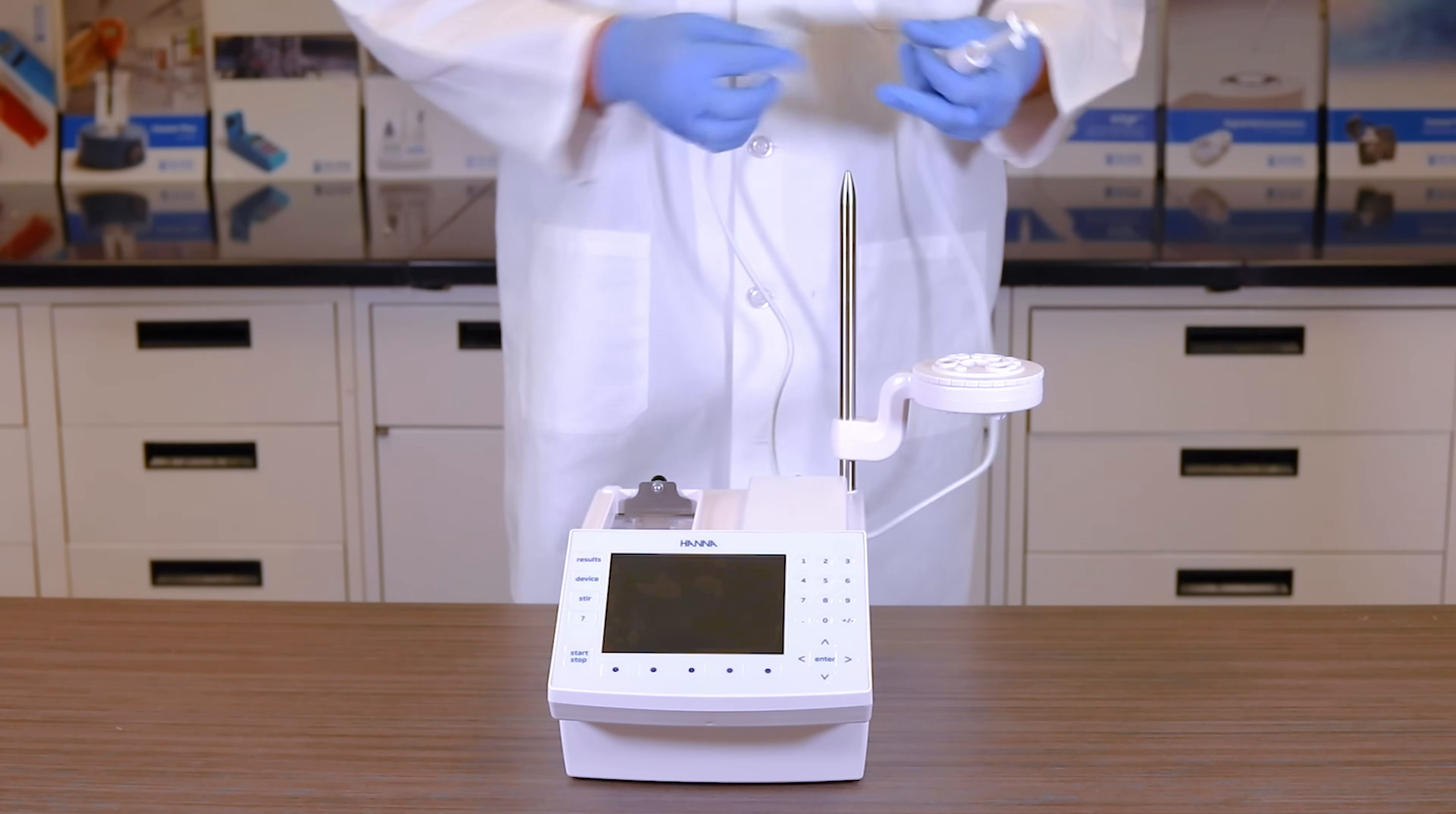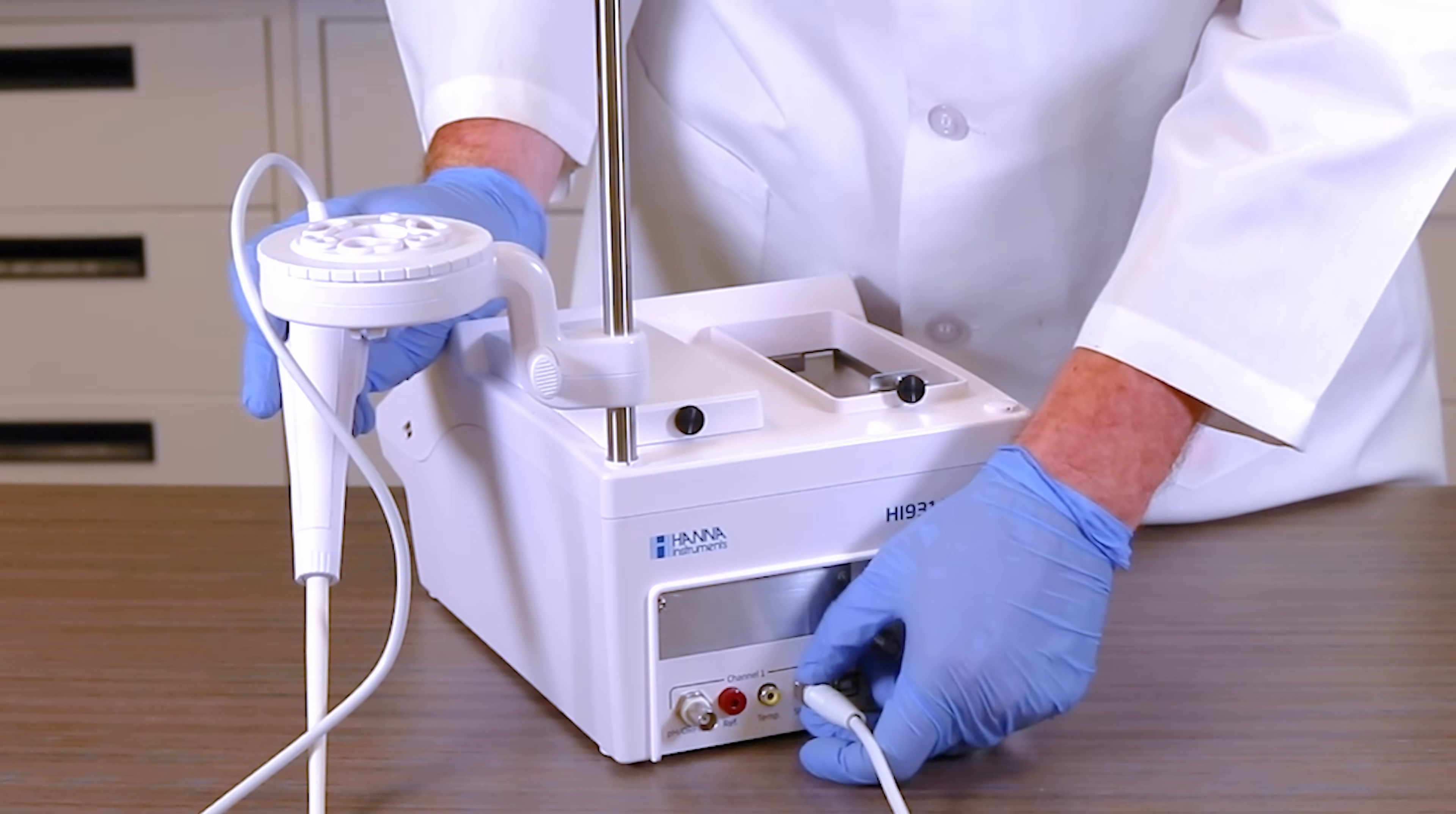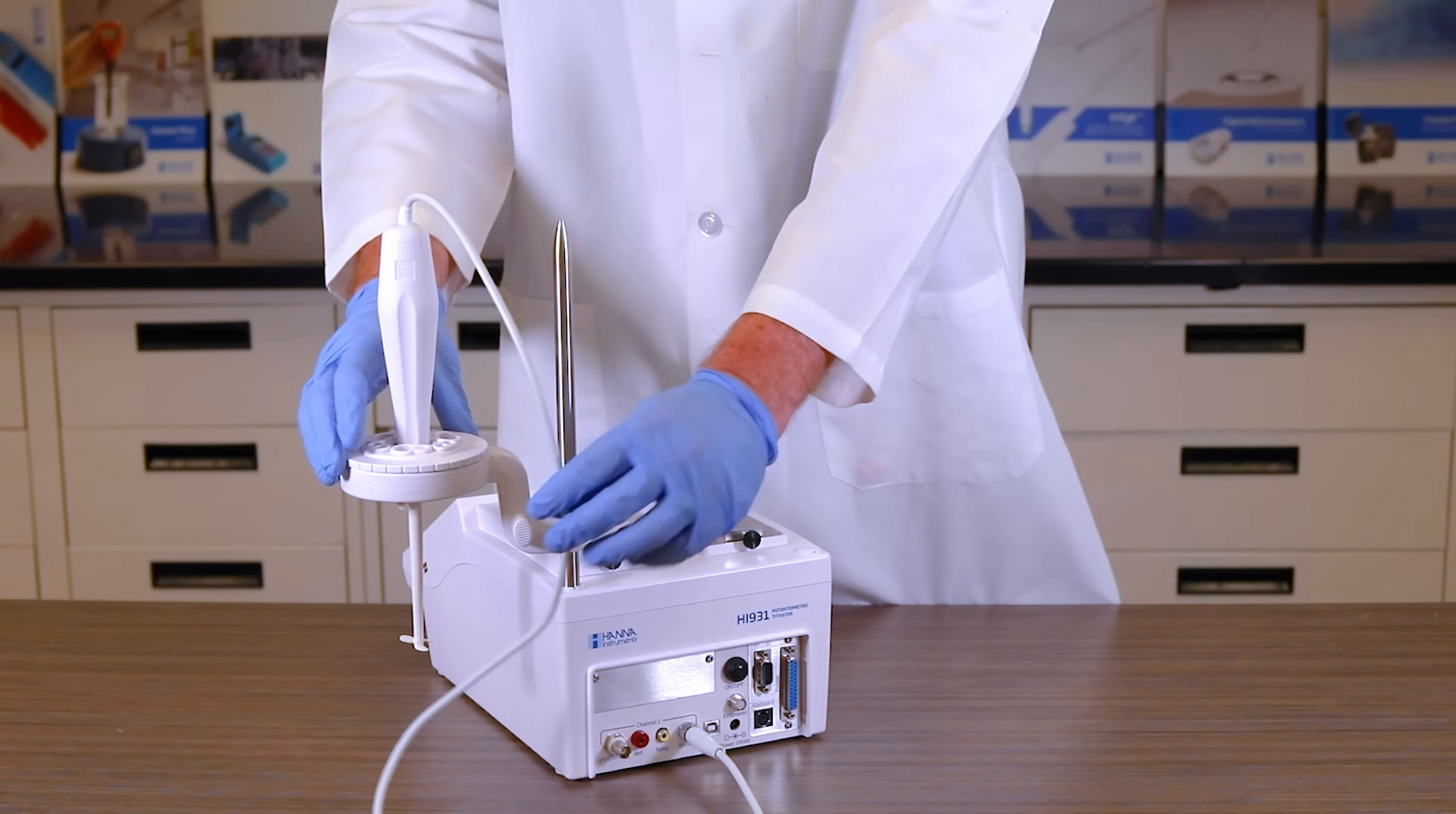Find your overhead stirrer and plug it into the back of your titrator. Then, place it into the middle slot of the plastic assembly holder.